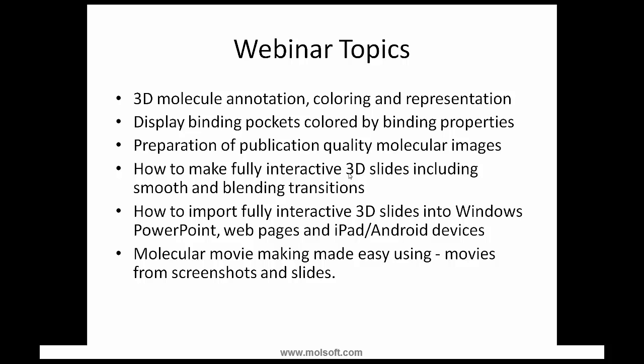And then how to import these slides into Windows, PowerPoint and web pages, and also you can view them on your iPad or Android devices using iMolView, which is a free download from Google Play and the Apple Store. And then I'll show you how to make molecular movies based on the slides that you make or directly from a screenshot.